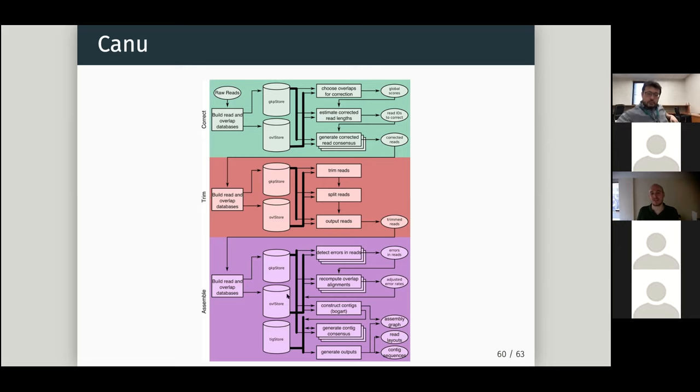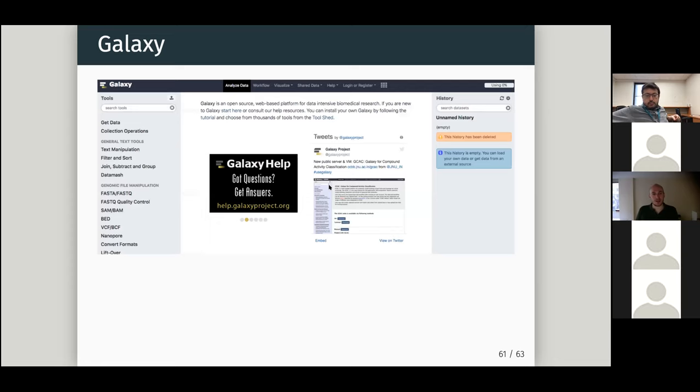You can see that this tool has a ton of different steps. It's highly demanding, so again, a human genome could take a few days, even on our large cluster. And that's why the entire world of genome assembly is rapidly shifting towards HiFi reads, because they are much easier to assemble. I think we're almost at the end of these 3 hours.